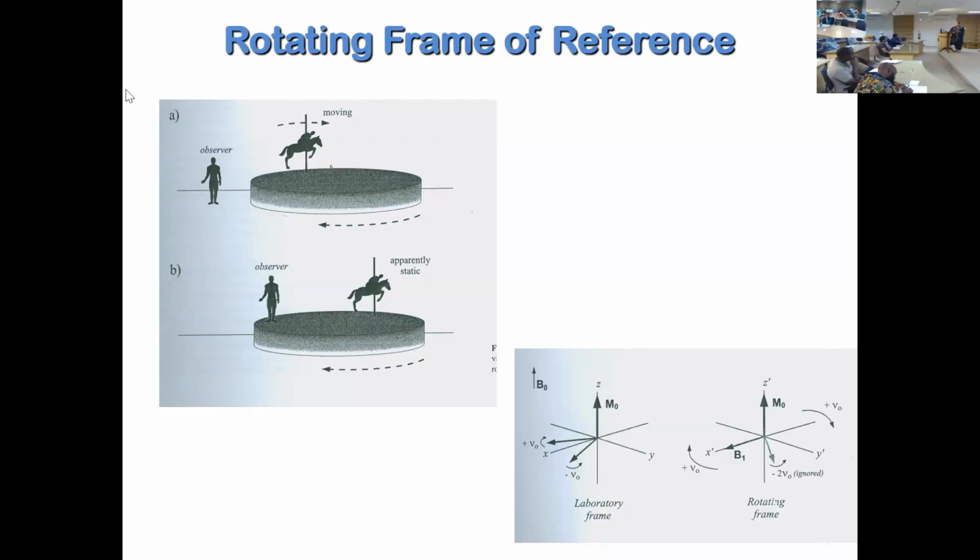For example, some of you have solved proton NMR and calculated the coupling constant, etc. These coupling constants are usually a few hertz, like 1 hertz or 2 hertz, 10 hertz. These protons are not moving in hertz; they are moving in megahertz, but we are observing the difference in hertz. Why are we observing it? Because the detector is a rotating frame of reference.